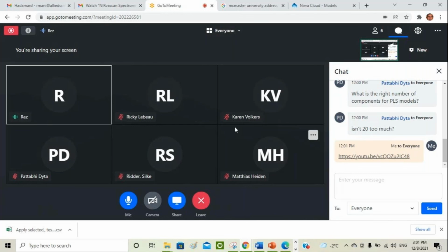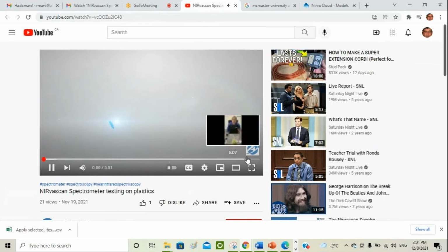Okay, so I did a measurement of basically any type of plastic, and then the measurement was sent to the cloud, and the cloud runs the LDA model and sends back what type of plastic it is. So see this. Actually, let's watch this a little bit.